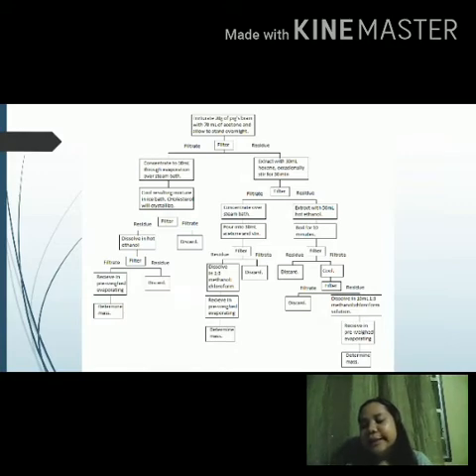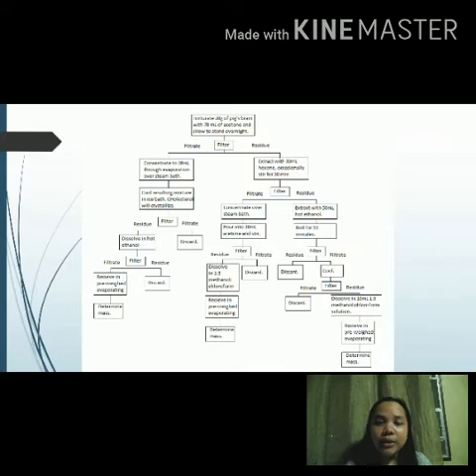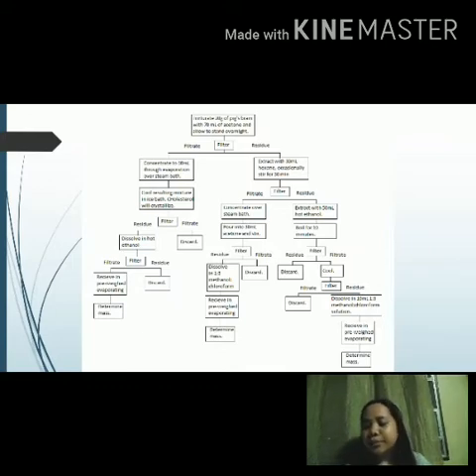It was then filtered and was washed with 20 ml acetone. The residue was set aside for the preparation of phospholipids and sphingolipids. So, by this procedure, how was cholesterol isolated? To answer post-laboratory question 1, only cholesterol goes down with acetone because saponifiable lipids can't be soluble in the acetone polar group, unlike cholesterol, which has a free alcohol group.